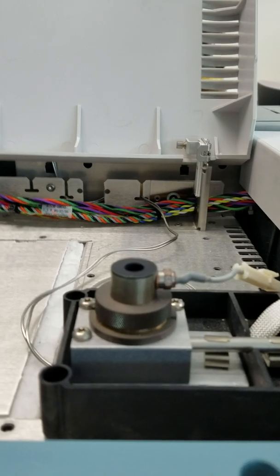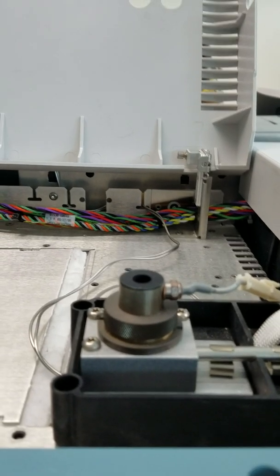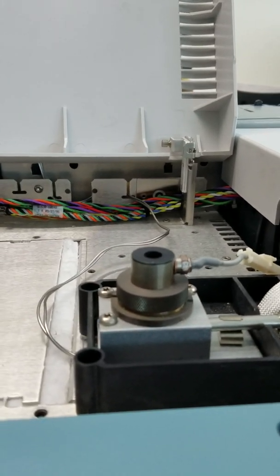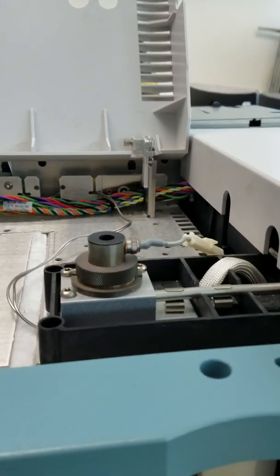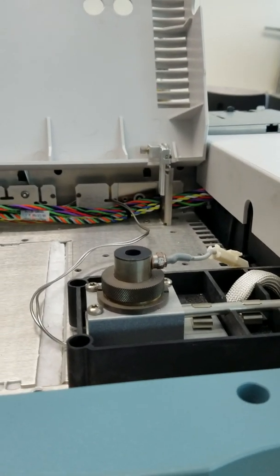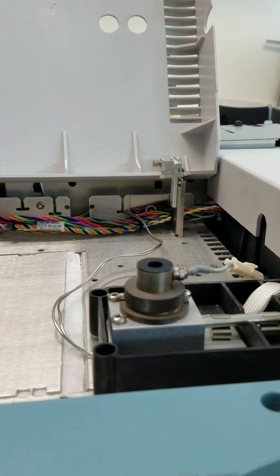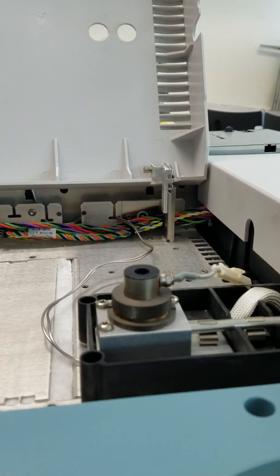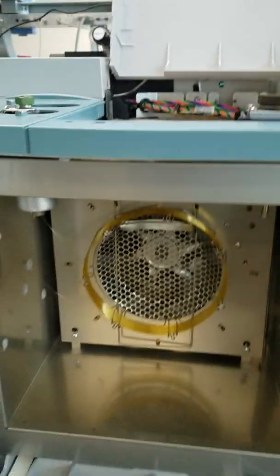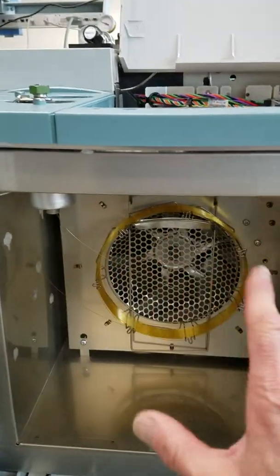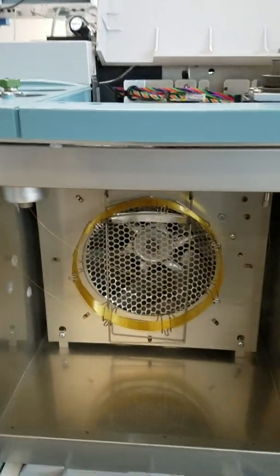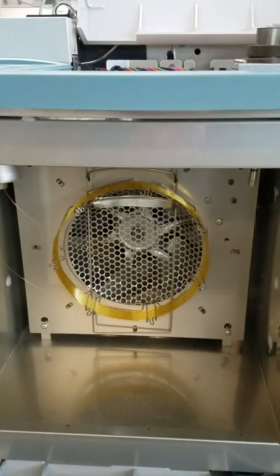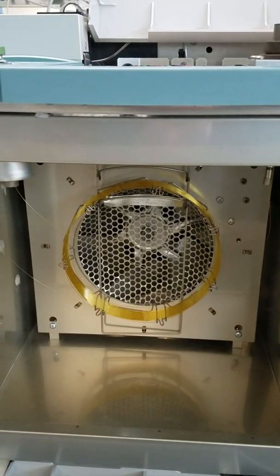This little component right here that I'm putting my finger on is an FID detector - a flame ionization detector. Really popular, really sensitive, really good for analyzing hydrocarbons.